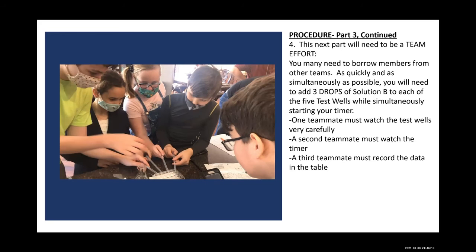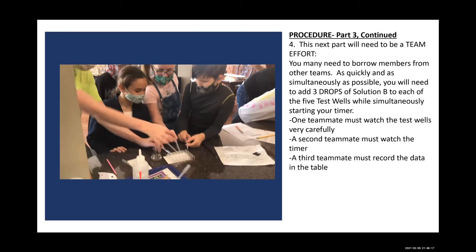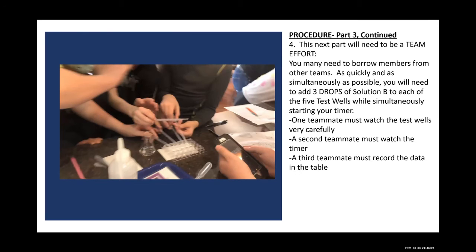No, that one. Wait, all right, Drew, are you trying to get in there? Drew, don't pour it yet, don't pour it yet. Move over. Pedal it. Okay. Switch, Drew. You go around. Drew, this is gonna go great. I know. 148. You start.